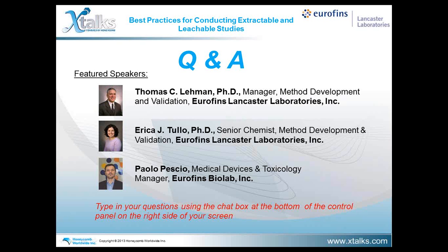Okay, thank you for that answer. Another question here. How do you convert the micrograms per milliliter to micrograms per centimeter squared?